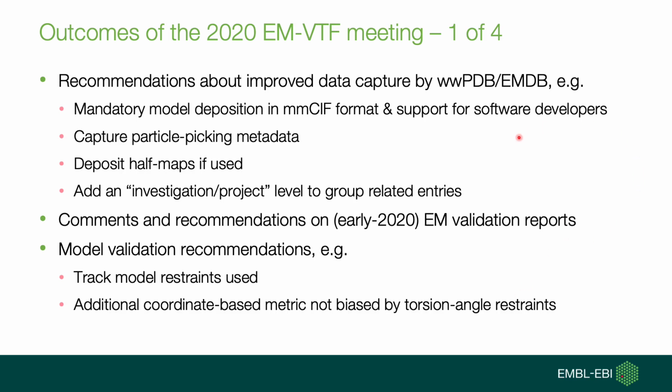There were recommendations about how wwPDB and EMDB could improve data and metadata capture. For example, demanding that models be deposited in mmCIF format, perhaps capturing particle picking metadata. Half maps should be deposited if they were used in the study, and there were also recommendations on how to group related entries in the PDB and EMDB. At the time, there were some rudimentary EM validation reports available, so we got a lot of comments and recommendations on those. And there were a few recommendations on pure model validation.